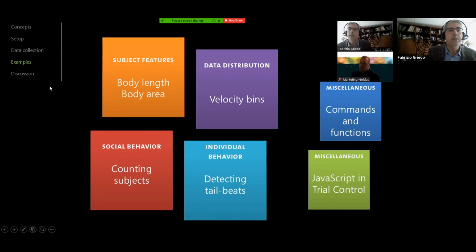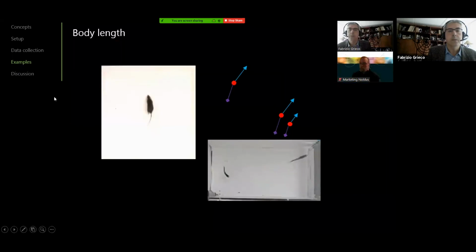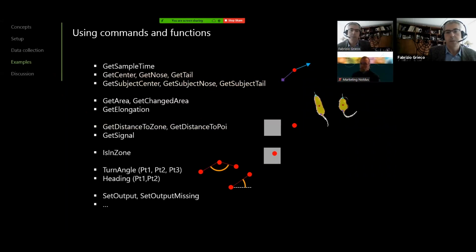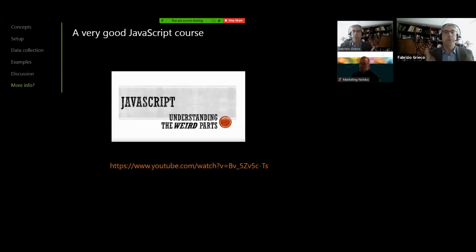And let's see, we've done this. Yep, all done. And quickly, if you are interested in JavaScript, there's a very good course that you can follow online. The first 3 hours are free. It's made by Tony Alicea. I recommend this course for 2 reasons.